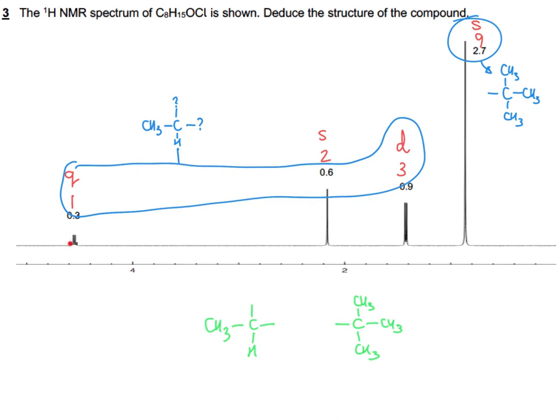This is quite a large chemical shift. We're referring to this part of this environment here. It's quite a large chemical shift. I know that I've got a chlorine. I also know that I've got an oxygen, but this is beyond what I would expect for anything with that single oxygen. So that pretty much tells me that the chlorine must be here. So let's do our audit.